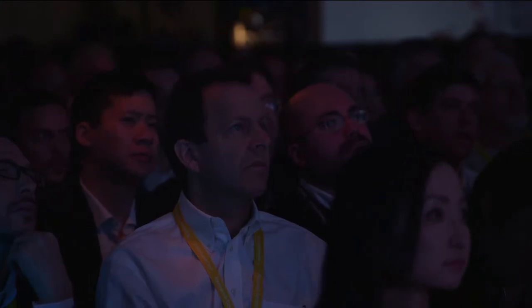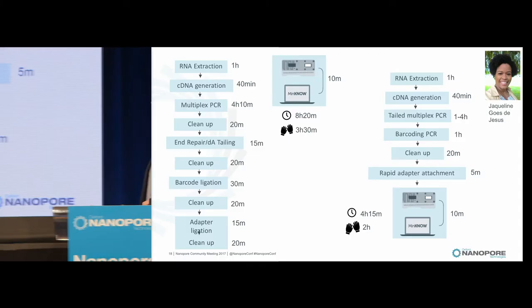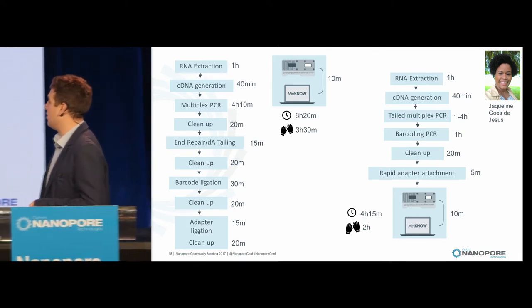That saves some time. So this is the old method on the left. We think it's about 8 hours in total. So it really tended to be used over 2 days. And about 3.5 hours of hands-on time.